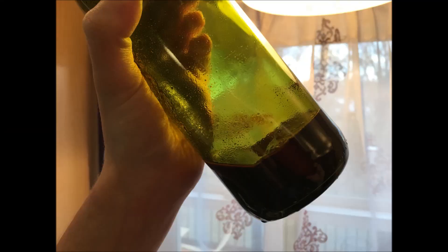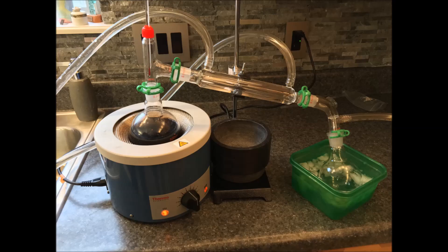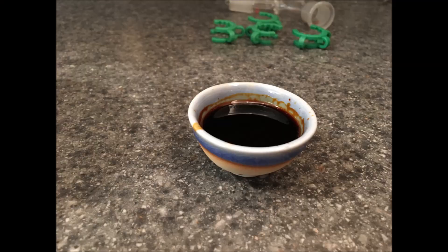Once the week is over, drain your alcohol into a flask and you should be left with a sludge of peppers on the bottom of the container. If you can, set up for a vacuum distillation. If not, a simple distillation will work fine. After most of my ethanol has boiled off, I was left with a gooey liquid and I set it in an open container to let the rest of the alcohol evaporate.